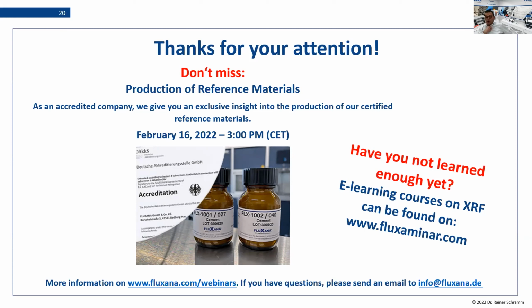And if you want to have a real physical answer, you have to go into the table, and for every element, you will find an absorption edge, and this is really the minimum energy, minimum voltage you need to excite that element, and this is increasing as the atomic number is increasing. So there is not one answer for this question. You really have to get the answer for every element.